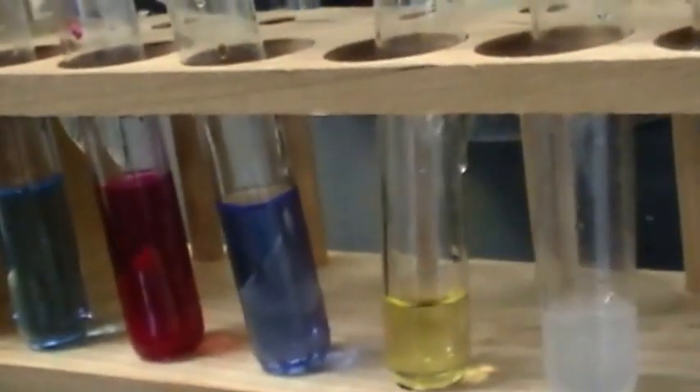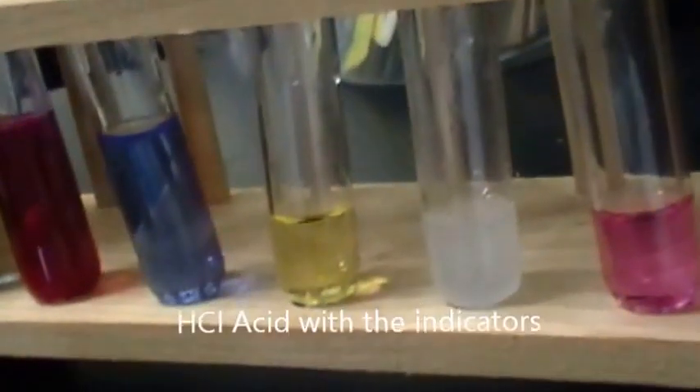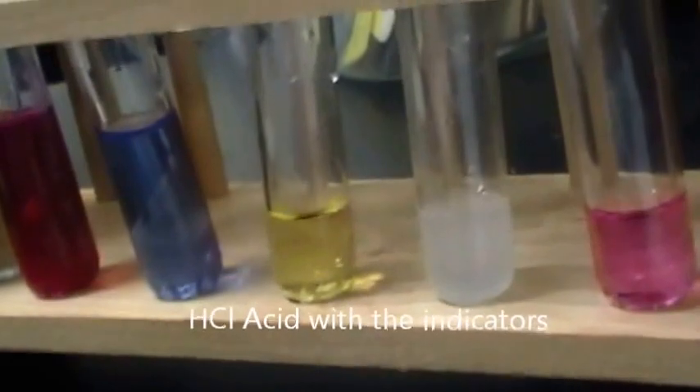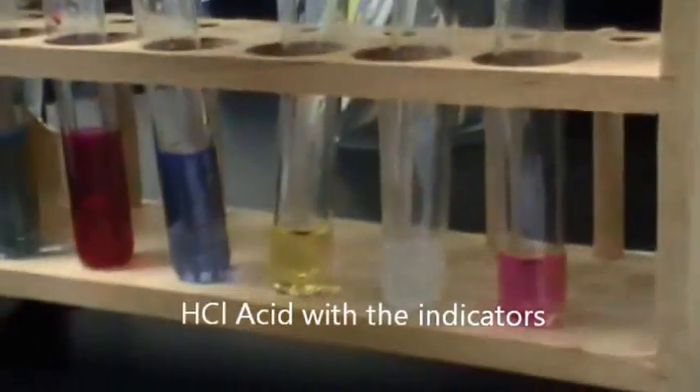Alright, so now we're going to do the hydrochloric acid ones. Correct. So we're just going to add the sodium hydroxide to the hydrochloric acid, just like we did with the acetic acid. But now this one's a strong acid, so we want to compare the difference between them.